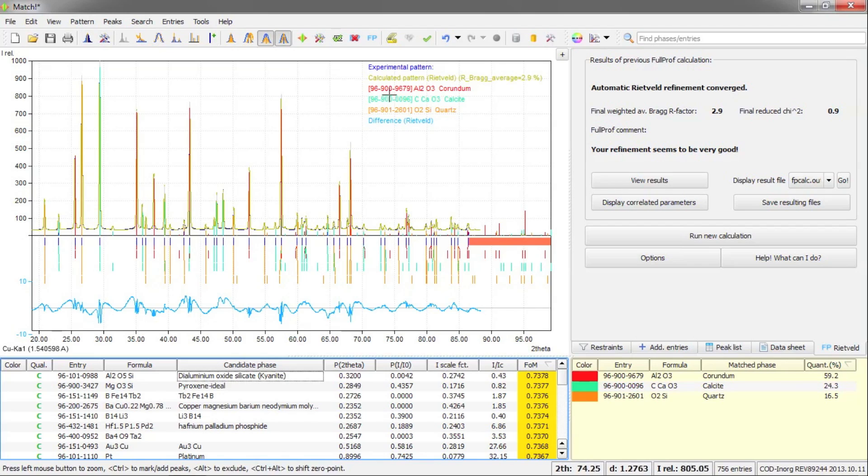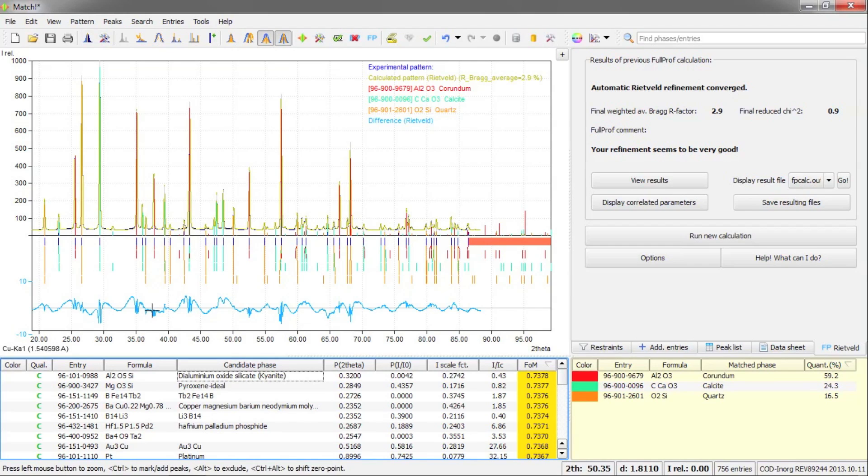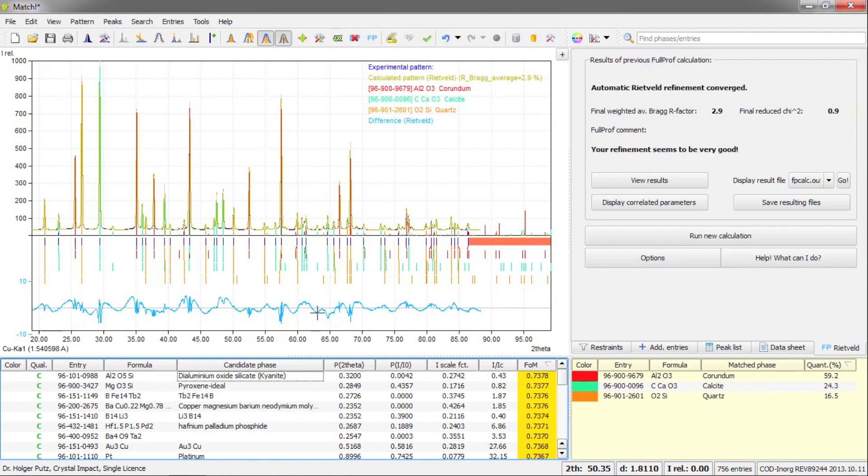Here on the left hand side, you can see this green curve that has been added. That is now the profile that has been calculated by FullProf. And below you see the difference plot between our experimental data and the FullProf calculation. As you can see from the scale here on the y-axis, this is very tiny differences only left. So we are very sure that this is a correct phase identification.